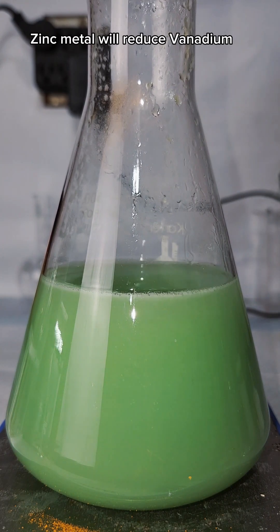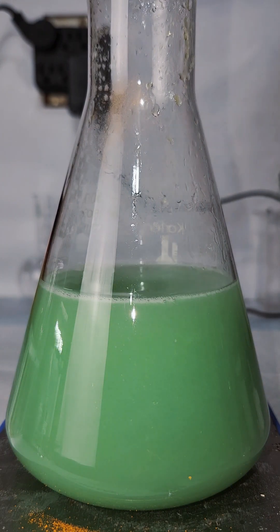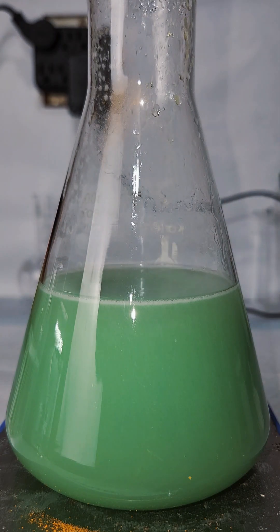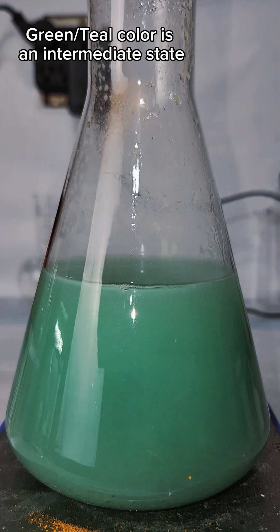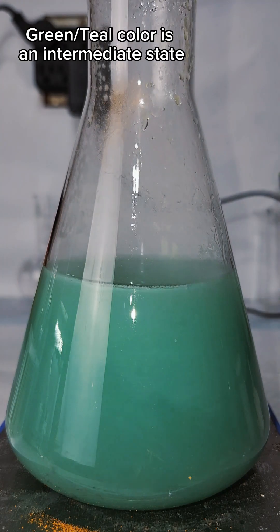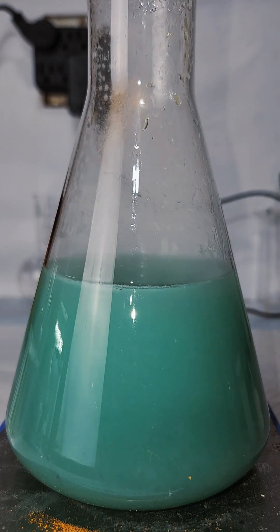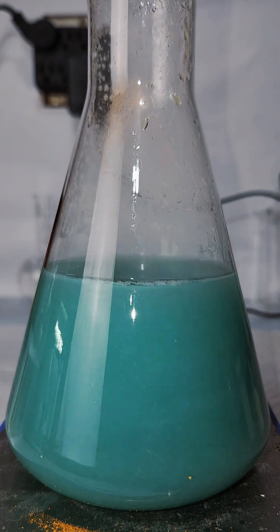This demonstration relies on the fact that different metals have different affinities for electrons, which we call oxidation reduction potentials. Zinc metal has a lower affinity for electrons than most metals, and will actually give up electrons to vanadium to reduce its oxidation state.